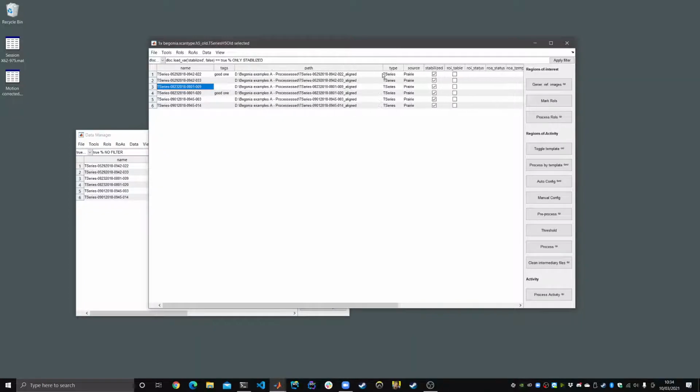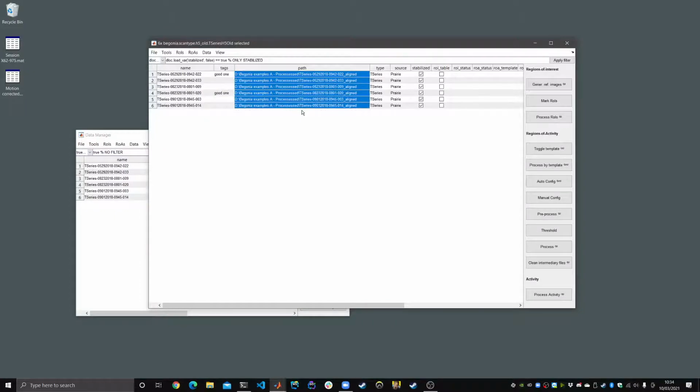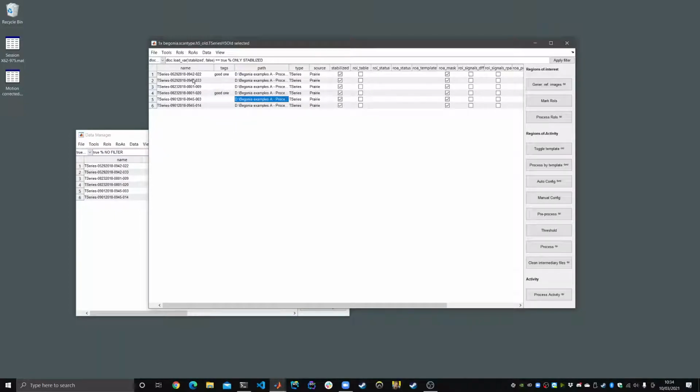So if you have a look here, you can see the paths of the actual data that we are loading. Begonia takes a very straightforward and simple approach to adding this type of metadata, and effectively any type of metadata, to a path. If you load anything, whether it's a file or a folder that has a path, you can associate additional data with it, and this is what we call the data location mechanism.